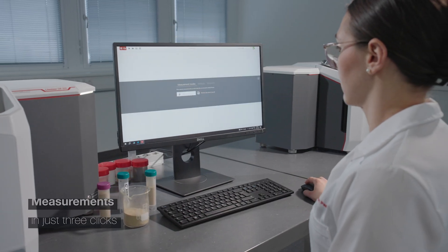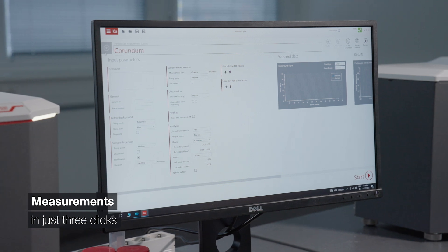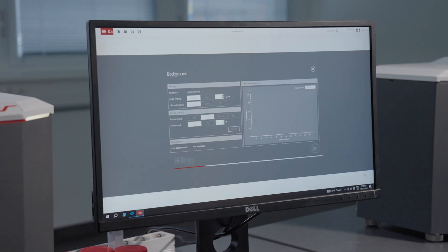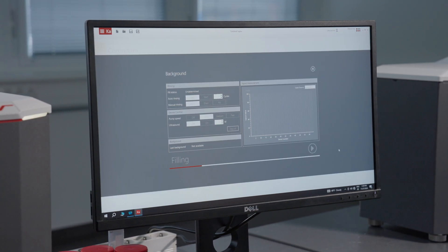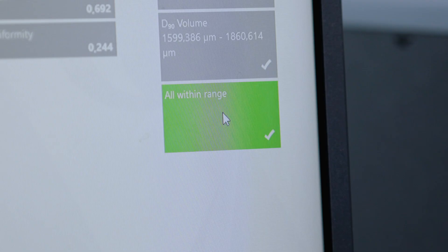You can't go wrong with the Calliope software. Measure in just three clicks. No software training required. A dedicated QC mode ensures parameter settings are always correct and applies clear pass/fail criteria to samples.